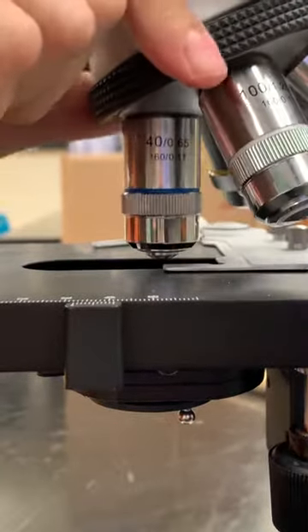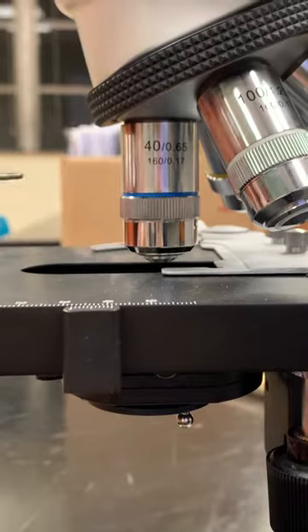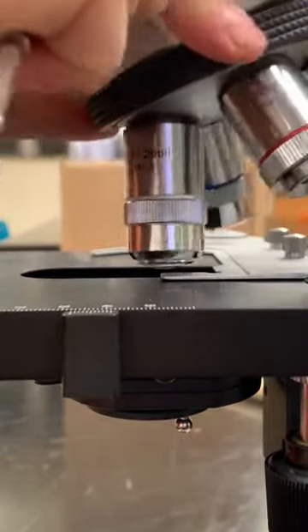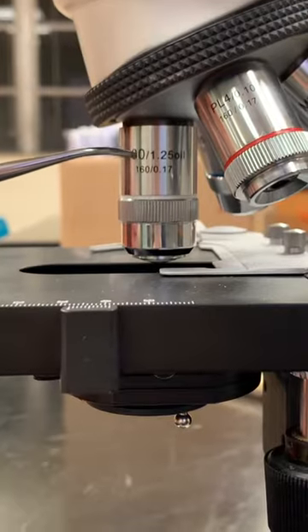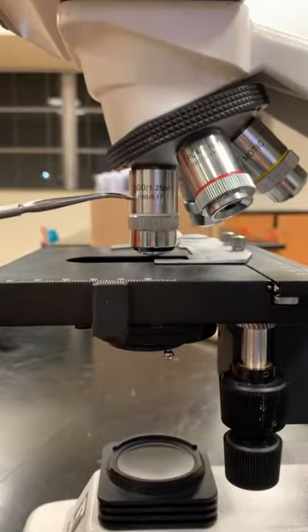Your blue one is your high power objective lens — it has a 40x magnification. The last one and the largest one is called your oil immersion objective lens, and it has a magnification of 100x. Know their names and their magnifications.